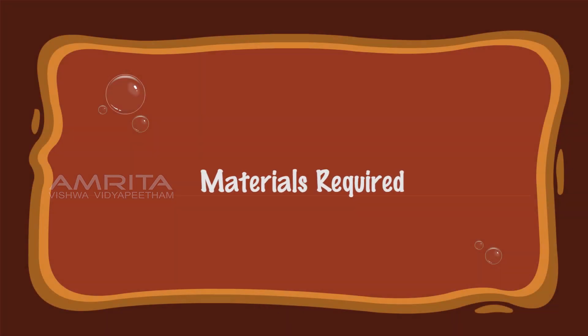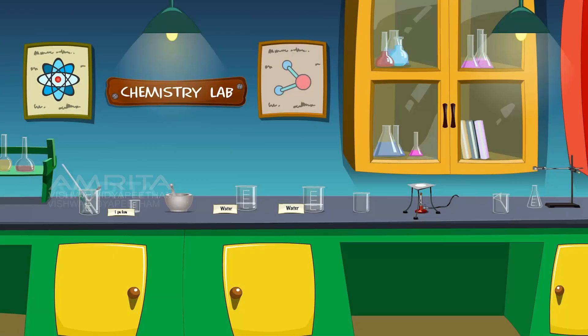Materials required: We require 1 gram gum, dropper, spatula, glass rod, pestle and mortar, distilled water, beakers, wire gauze, tripod stand, Bunsen burner, funnel, filter paper, conical flask, and iron stand with clamp.